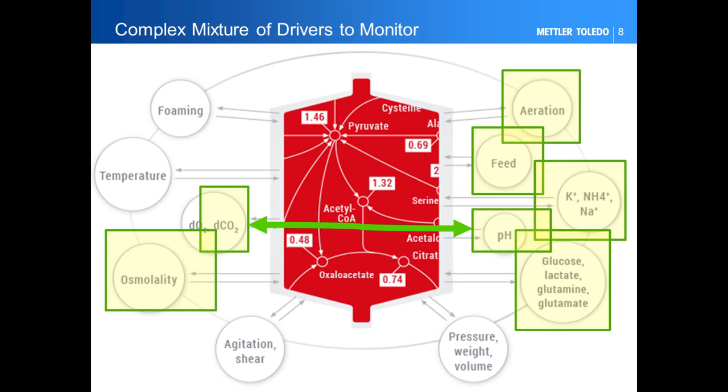Other outputs, such as media osmolality, the accumulation of byproducts such as lactate and glutamate, and unwanted oxidative stress conditions are also going to be impacted by dissolved CO2 and how to maintain it at a desired value. So maintaining a desired dissolved CO2 content in media with an increasing cell population is going to impact pH control positively at any scale.